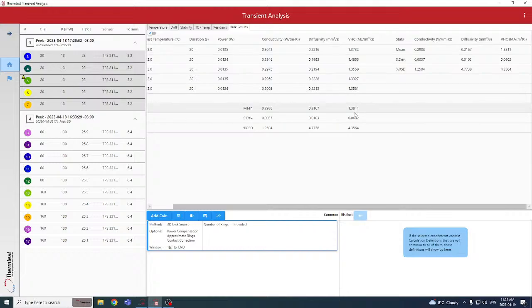So that concludes the demonstration and a description on how to measure different dimensions of a PEEK or a polymer type material with the capabilities of the MP-1. Some of these capabilities are on the TPS-2 as well, so obviously you're able to measure these types of materials with the TPS-2. Just the MP-1 gives you quite a bit more punch depending on temperature range and some of the complexities that the sample can have.